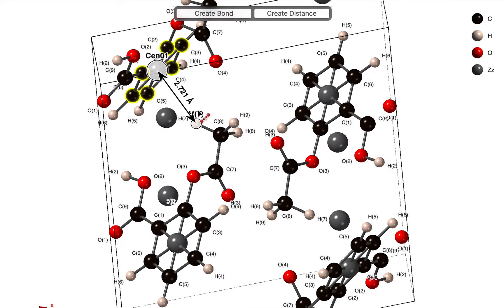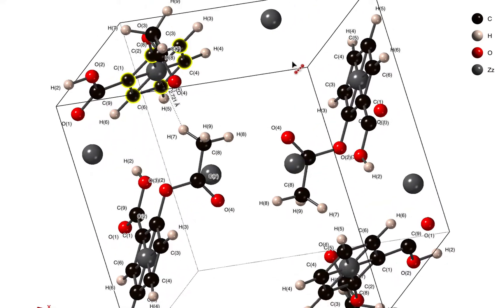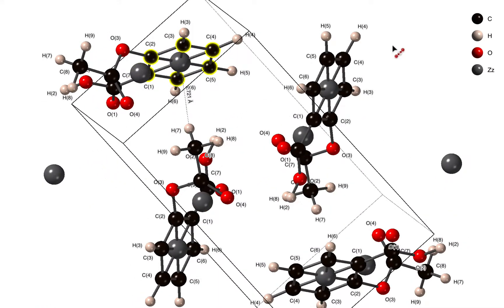Now if we want to preserve that measurement we can click on the create distance button that appears. Now that we have our measurement, I'm going to delete that dummy atom.